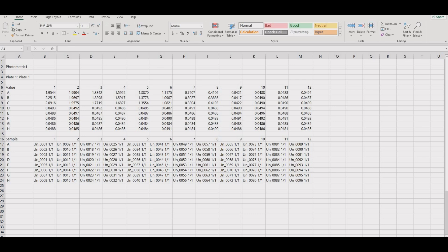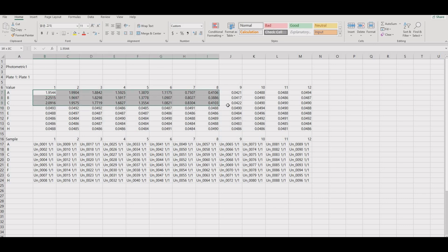Here we have some sample data and it should be similar to the results you get from your experiment. The first step is to isolate the relevant data. You can do this by selecting your data and highlighting it.